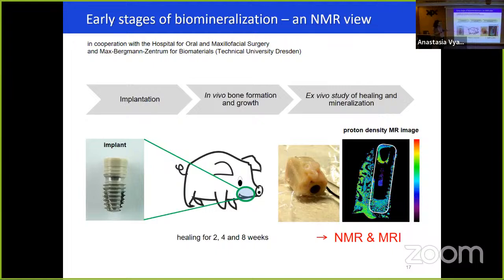The colored image surrounding this implant results from living tissue, and we were interested in the cavity beneath the implant. It was first empty, and then new tissue was formed in this region. We looked at how it is formed, and its structure after 2 weeks, 4 weeks, and 8 weeks.